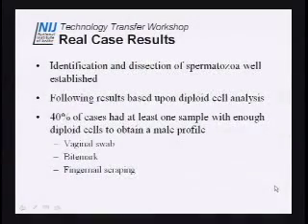Real case results. The real meat of this matter is, can this work on a real case? And as Kelly was talking about, we have a number of non-probative rape kits. We probably have 30 to 50 kits they've given us that they've closed out. These are sitting in the evidence locker. I know there was a question about degraded DNA. Well, some of these kits are 3, 4, 5 years old. They've been sitting at room temperature. So we've got a really good base of non-probative sexual assault cases to work with. And we don't know the results of them. We haven't actually taken them out and tried running them yet. They were closed out before we even got to the case.